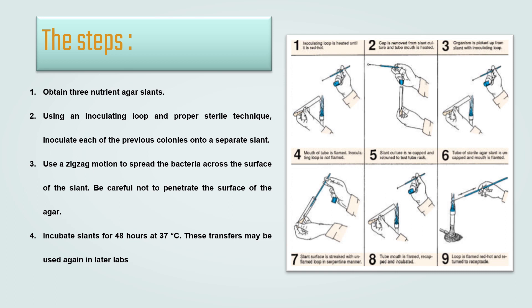Step 1: the inoculating loop is heated until it is red hot. Step 2: the cap is removed from the slant culture tube and the tube mouth is heated. Step 3: the organism is picked up from the slant with the inoculating loop. Step 4: the mouth of the tube is flamed and the inoculating loop is not flamed. Next, the slant culture is re-capped and returned to the test tube rack.